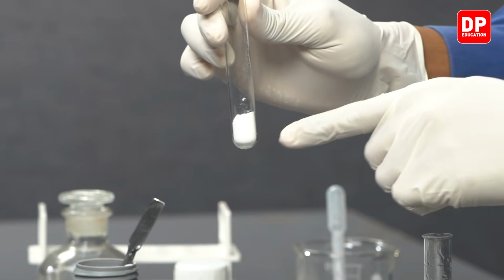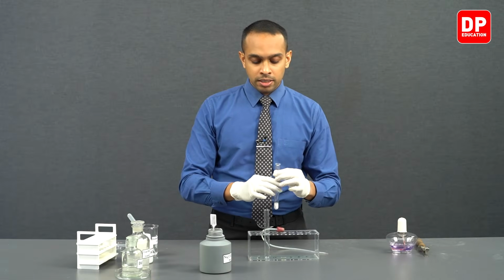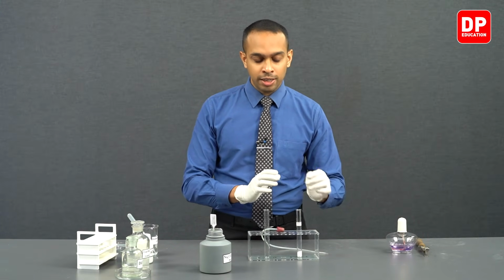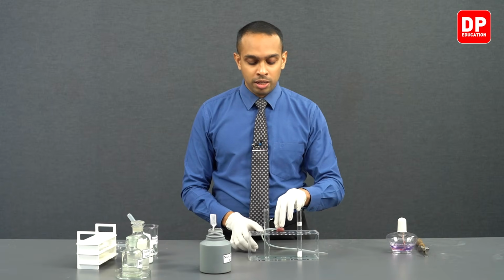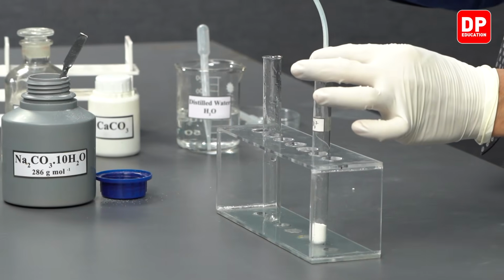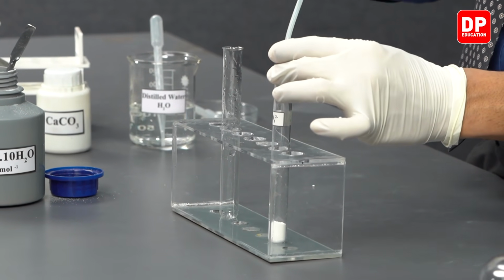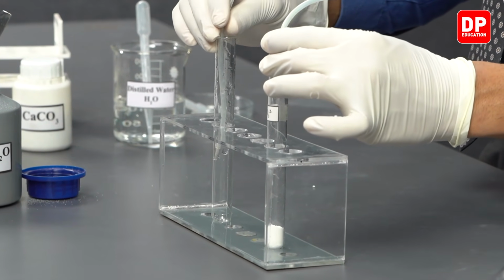Now we have taken a small sample of sodium carbonate here, and we are going to be adding hydrochloric acid to it. And as soon as we add the hydrochloric acid, we will place this rubber stopper connected to a delivery tube, and the produced carbon dioxide will be sent through lime water.